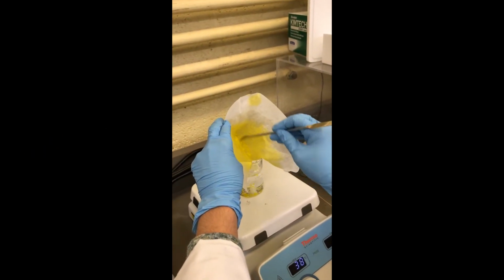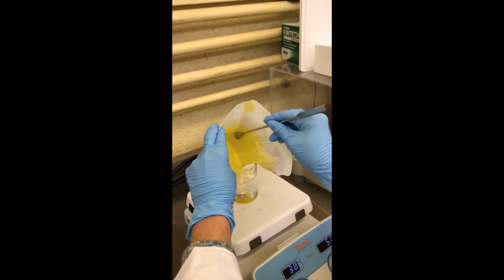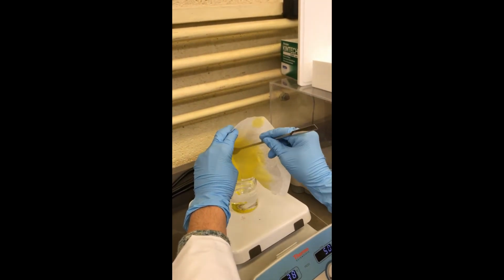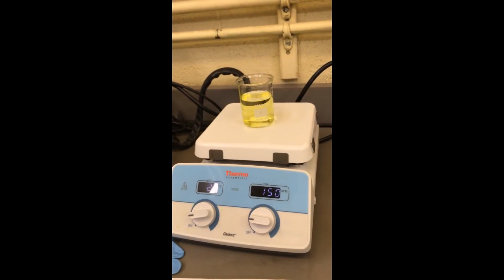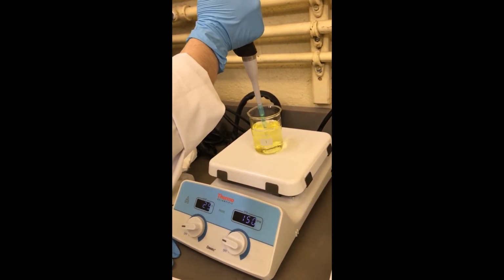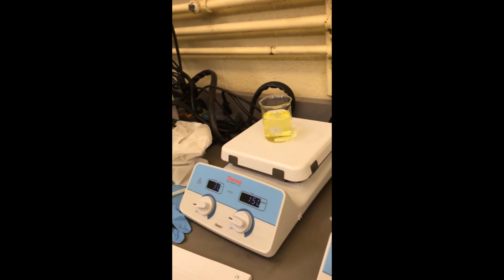After polymerization time, the beads were segregated using a coffee filter and sprinkled with water. The resulting beads were then loaded into a 500 milliliter beaker with distilled water and known stir rate and temperature. Aliquots were measured at 2-minute intervals for the first 10 minutes, 5-minute intervals for the following 20 minutes, and 10-minute intervals until the 1-hour mark.